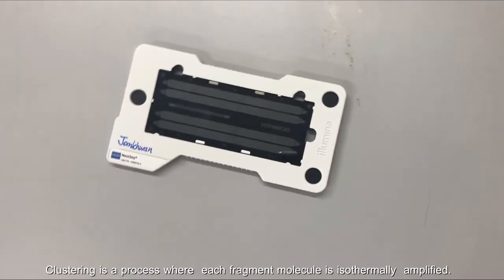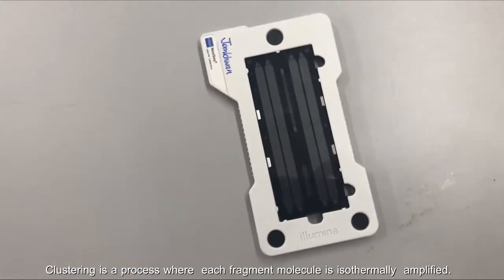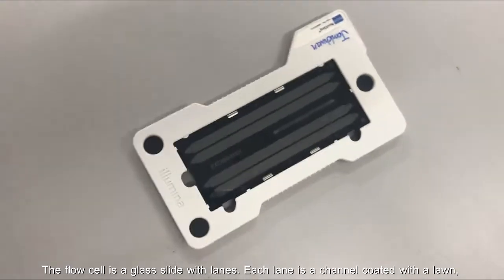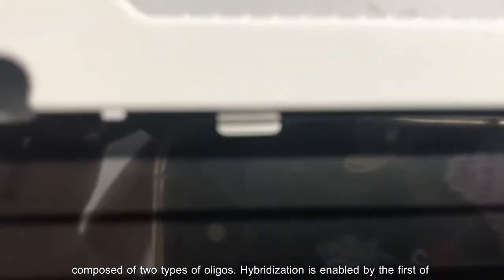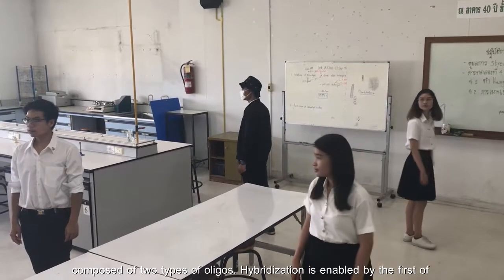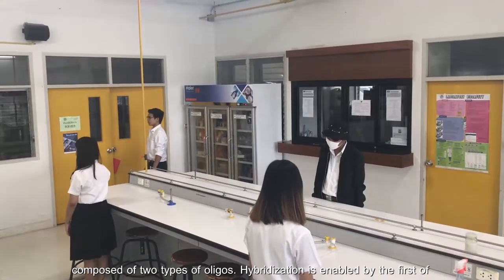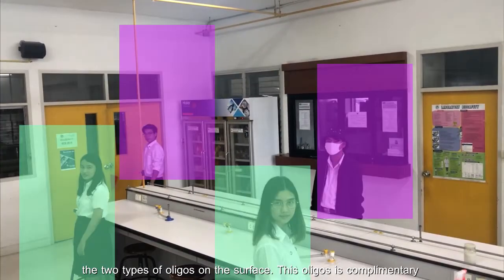Step 2. Cluster generation by bridge amplification. Clustering is a process where each fragment molecule is isothermally amplified. The flow cell is a glass slide with lanes. Each lane is a channel coated with a lawn, composed of two types of oligos. Hybridization is enabled by the first of the two types of oligo on the surface. The oligo is complementary to the adapter region on one of the fragment strands.